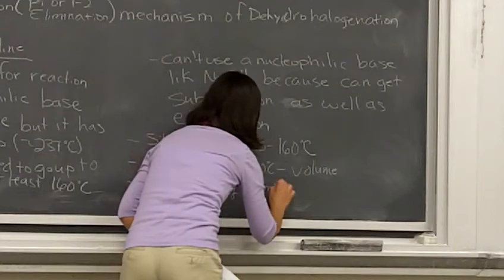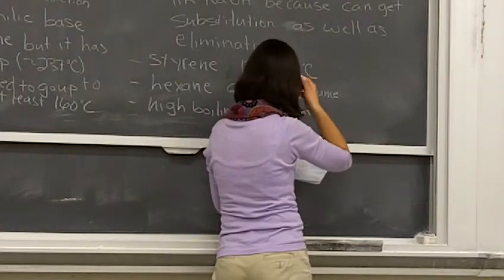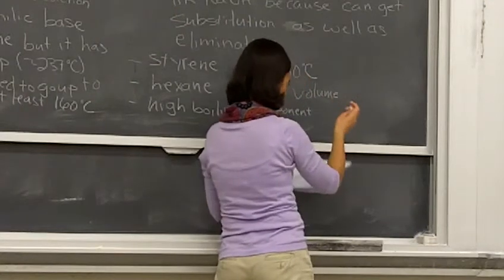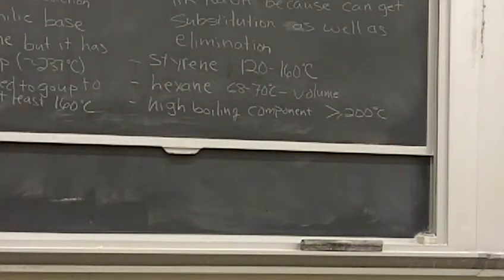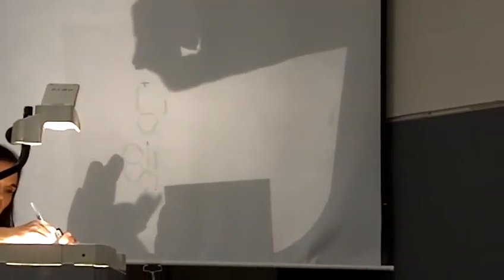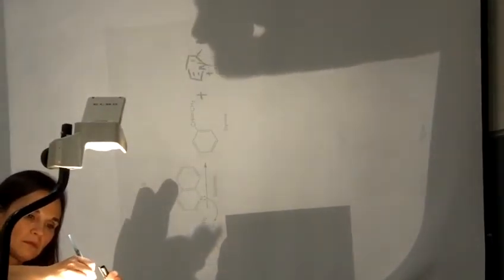The high boiling component is salts that are formed from the quinoline, okay? And so these guys are probably going to be upwards of about 200 degrees Celsius, this quinolinium salt. So when you form the byproduct of this reaction, you're going to keep your quinoline protonated, okay? So these salts are also going to be still in that reaction mixture. You're not doing anything to get rid of these. And these are going to be much higher boiling than what you want. Okay? And so those salts are going to cause us just a little bit of extra work.